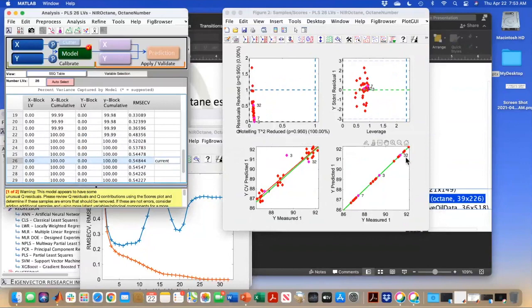Well, of course, the left-hand plot is telling us exactly that this is going to look fantastic, and it does. Over here on the left-hand side, I'm doing cross-validation predictions, and if I leave just one point out, look at this guy. He's poking way out there. We didn't capture him. So he is clearly an outlier in this case.